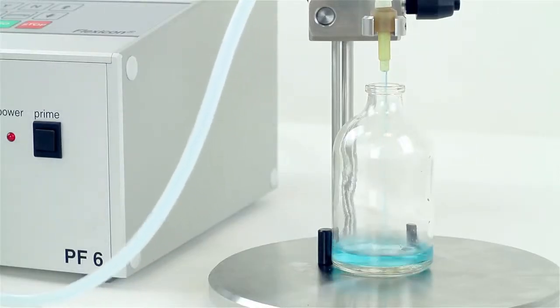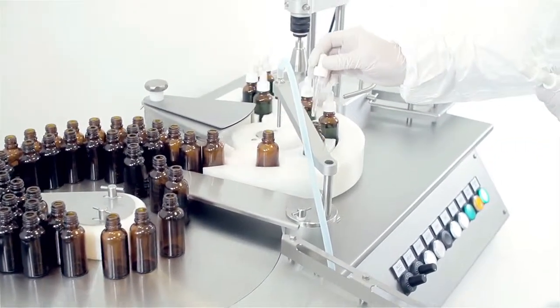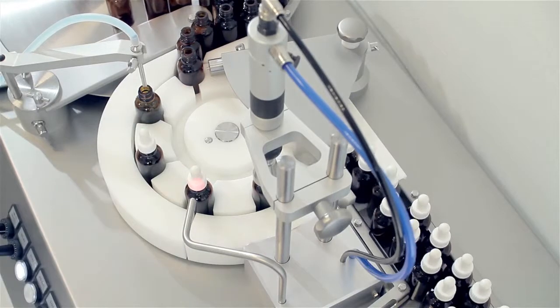The PF6 can be used as a standalone unit for manual filling or can be used with an automatic bottle handling system for larger batch production.